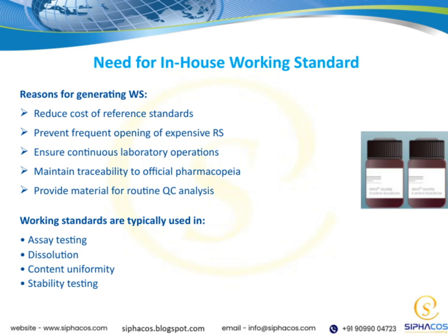Furthermore, having a reliable material on hand supports routine quality control analysis, whether it's for assay testing, dissolution, content uniformity, or stability testing. These are all critical areas where consistent, accurate standards are essential for producing safe and effective pharmaceutical products. Overall, developing in-house working standards is a strategic move to improve efficiency, cost-effectiveness, and quality assurance in your lab processes.